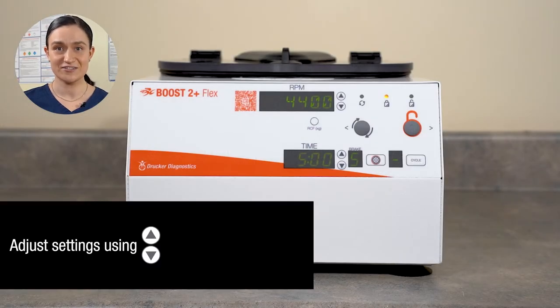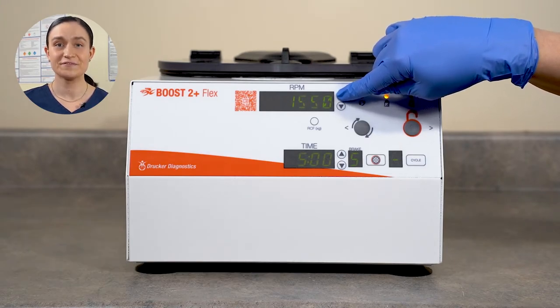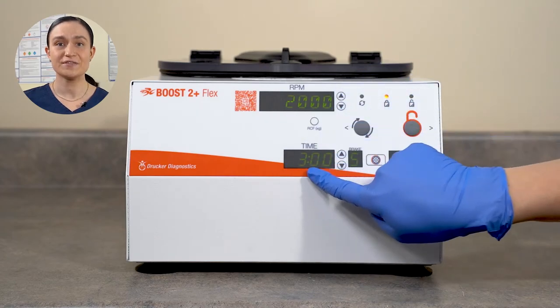Next, adjust your settings. You can adjust RPM and time using the buttons next to their display windows. For a more detailed guide, click the video on your screen. In our case, we're going to run at 2000 RPM for three minutes.